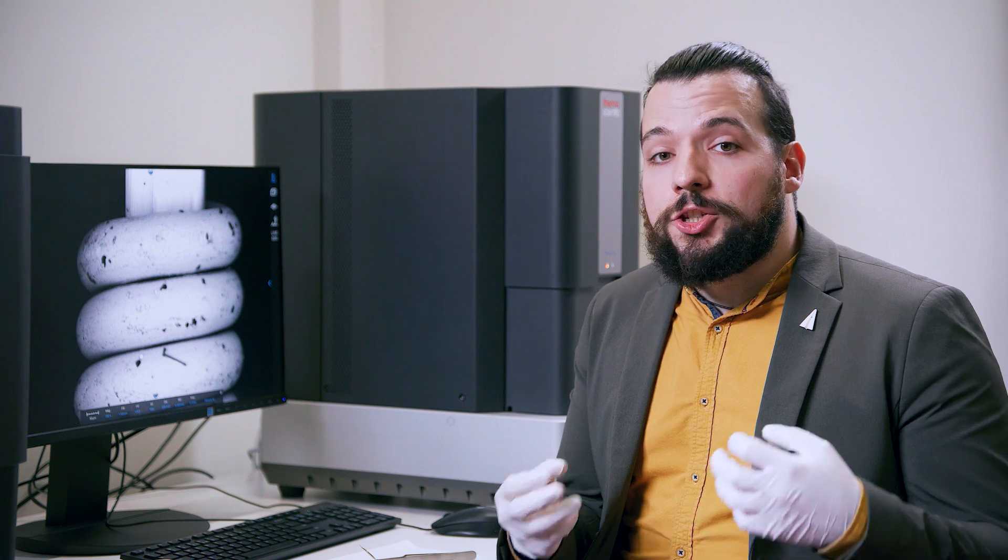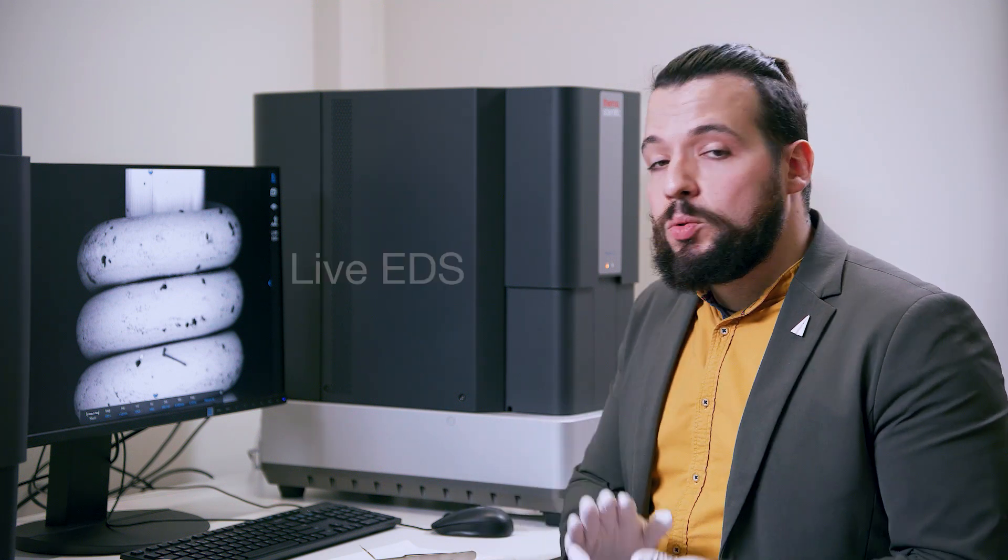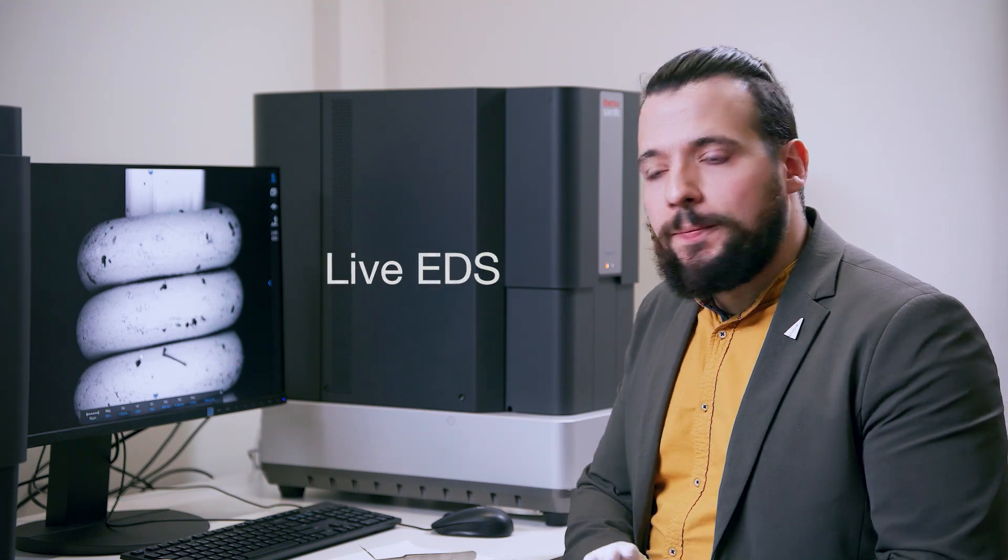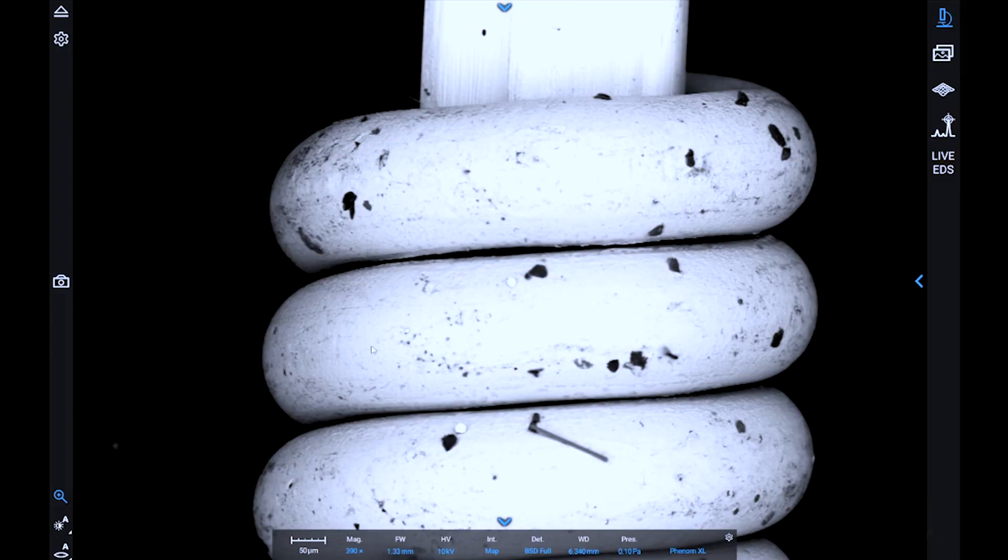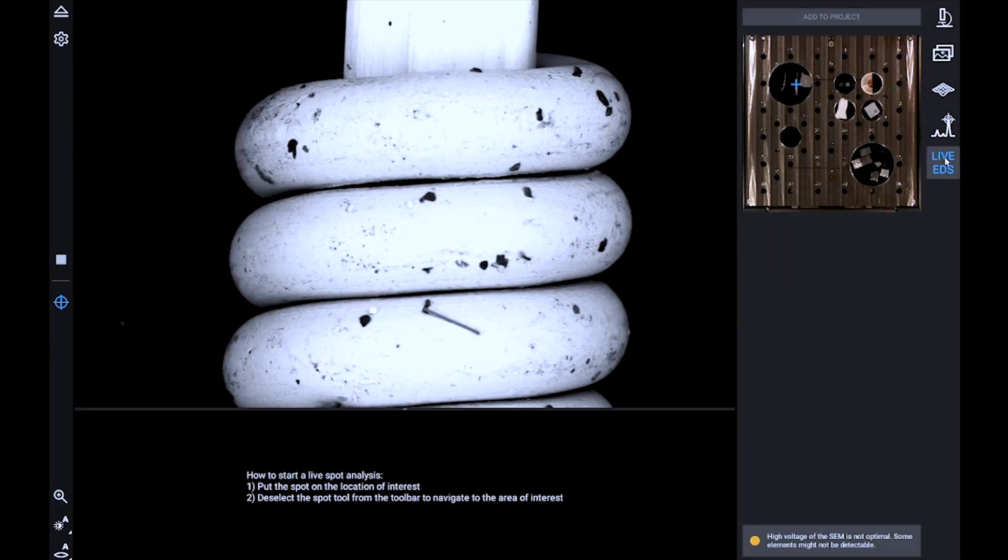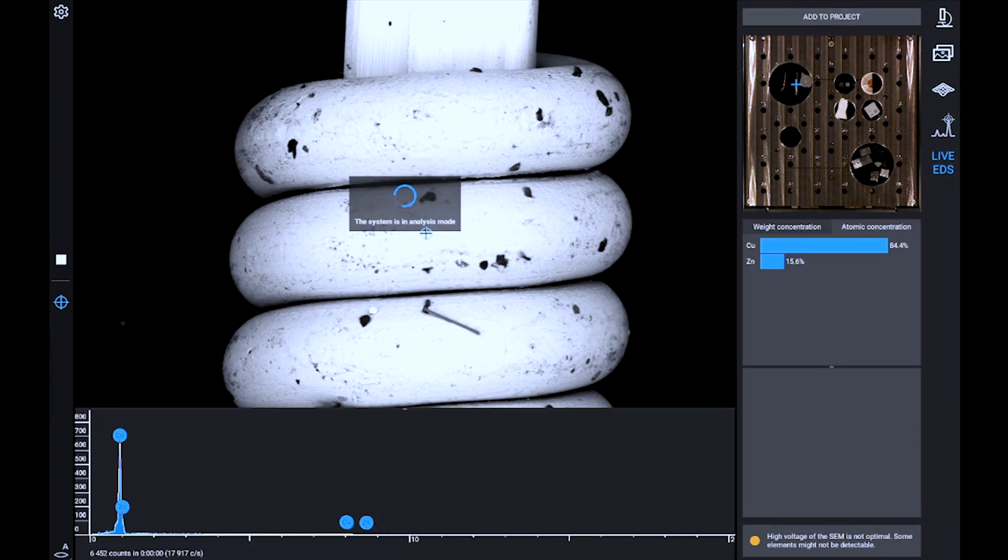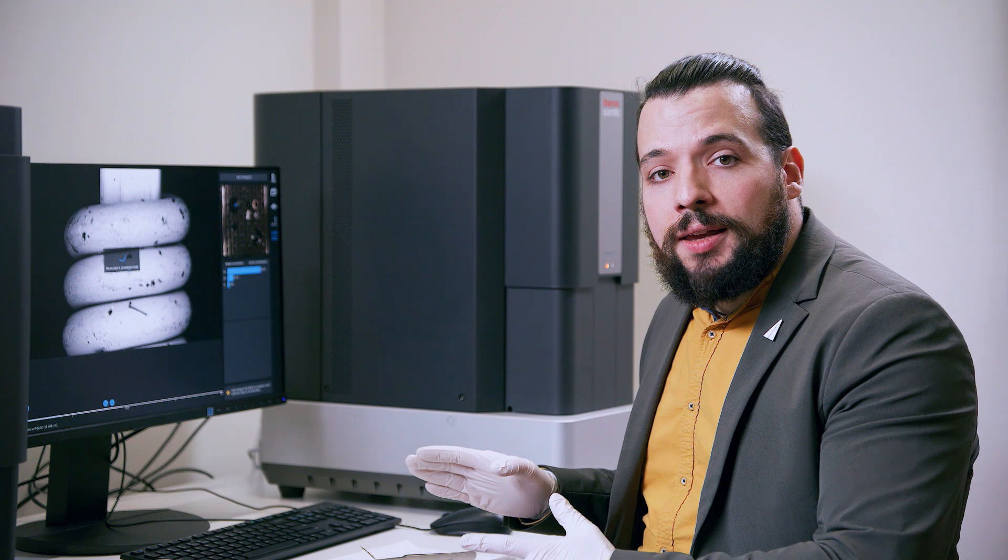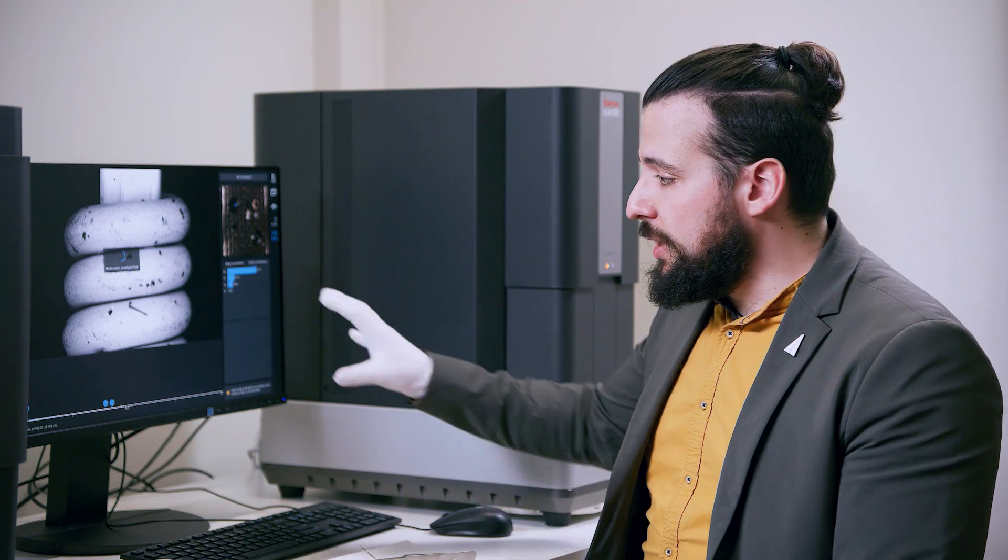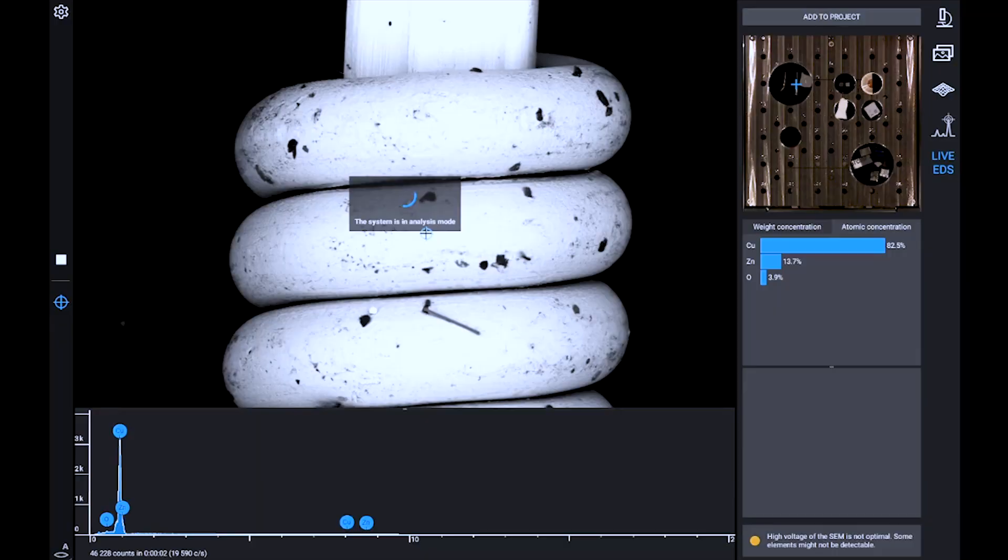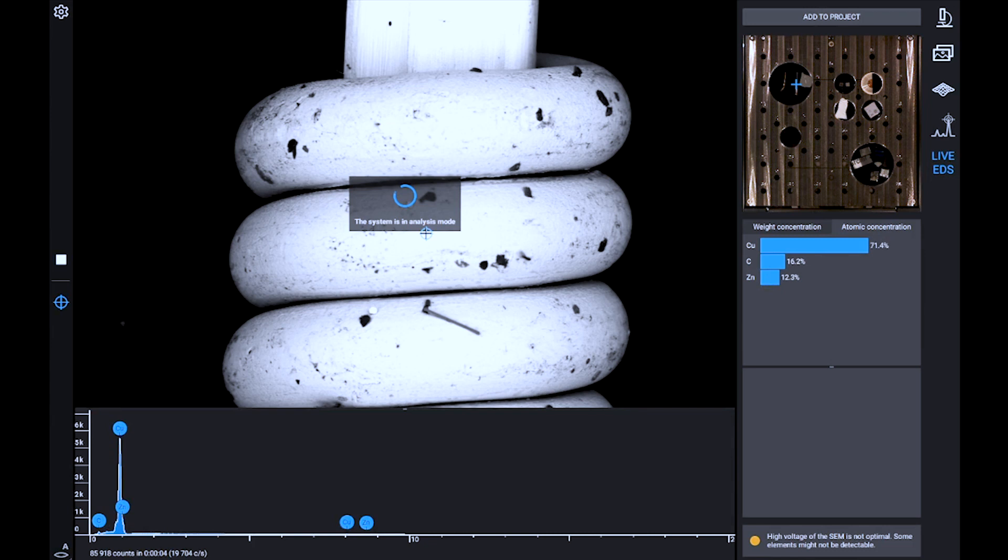Extra information, such as the chemical composition of the sample, is also quickly accessible thanks to our Live EDS functionality. By clicking on the Live EDS button on the right, we activate the option, and then we can click on the sample to start an EDS analysis. The spectrum acquisition is displayed on the bottom part of the screen, while the chemical composition of the sample analyzed is displayed on the side.